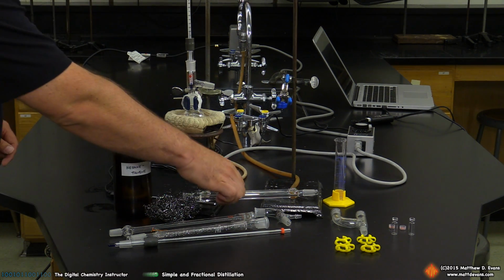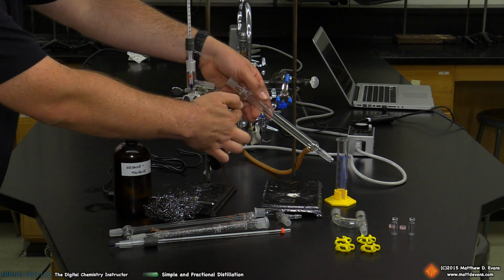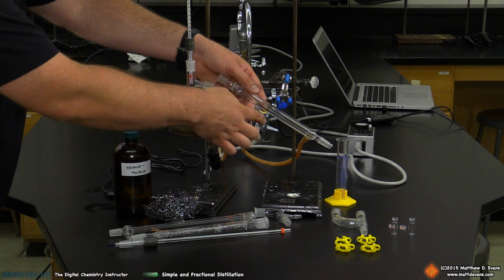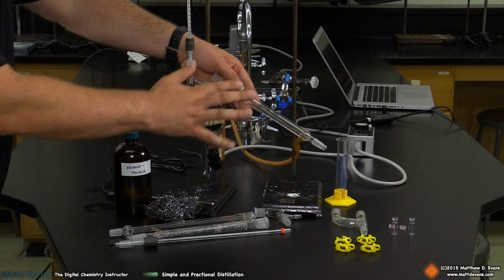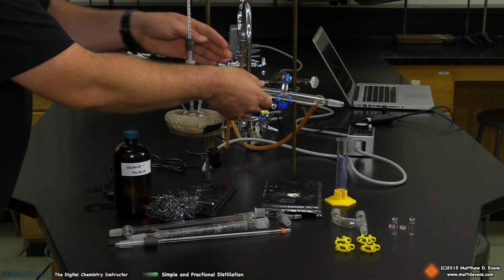The condenser: I've already pre-connected the latex tubing, but try to find in the front drawers long enough tubing. I'm going to really be stretching this because I'm a long ways away from the sink, but latex tubing that's long enough is going to easily fit over the condenser. The condenser is one of the more important pieces. Let me go ahead and hook this up so we can talk about this.